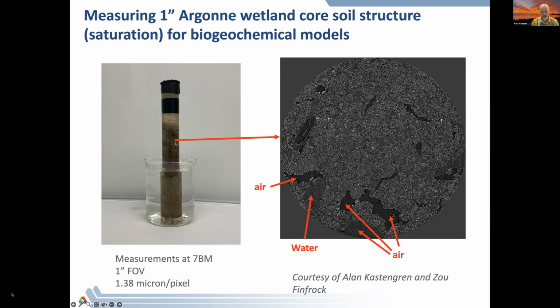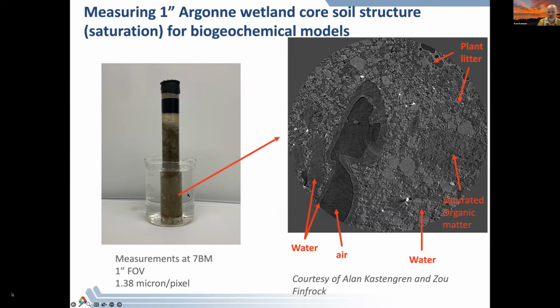And so looking at this location up here, doing a tomographic imaging at this elevated height, we were able to see a location where in fact there were still open pores, again indicated by the darkest color here, as well as water, a slighter gray color, indicating that advection of the water up in some locations. So you had this mixture of water and soil, or water and pores. We then go down to the bottom where we expected to see completely saturated pores. We found that is not necessarily what always has happened.